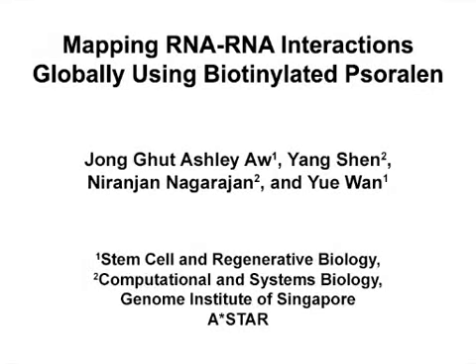The overall goal of this video is to describe the method for sequencing of Psoralen cross-linked, ligated, and selected hybrids, or SPLASH, in which pairwise in vivo RNA-RNA interactions are mapped in a genome-wide manner. This technique is a simple, high-throughput method for mapping the RNA interactome in vivo.